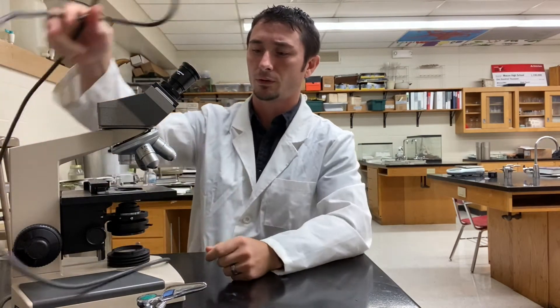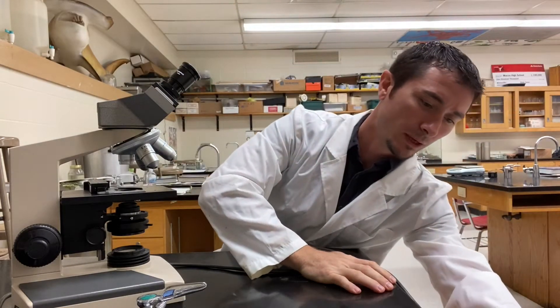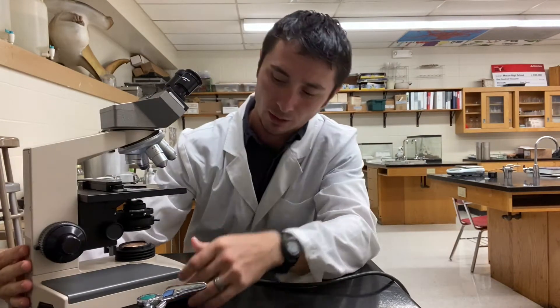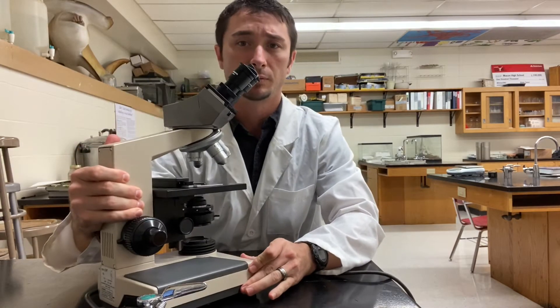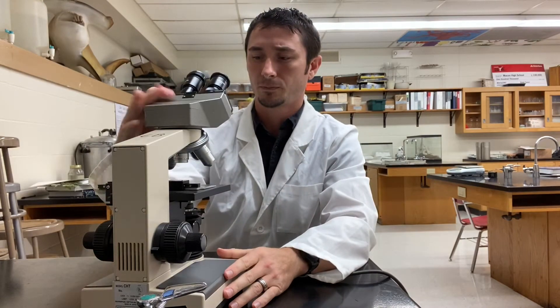The first thing you have to do is always unwind the cord from the base and plug it in. You always want to test your microscope to make sure everything's working properly — check that the light comes on. There's a light switch at the bottom, either at the base or on the side. Just flip on the light to make sure it works. If it doesn't, let me know — sometimes it could be an issue with the outlet needing to be reset.